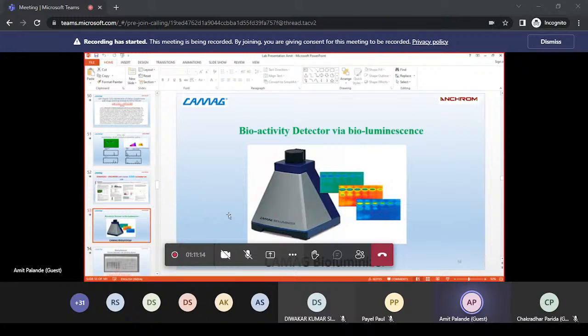The second example is the quantification of apixaban in apixaban tablets. We know apixaban as an anticoagulant or blood thinner tablet, which is used to prevent blood clots and to prevent stroke in people with non-valvular atrial fibrillation. It is detected in fluorescence mode, and then the graph is plotted. After plotting the graph, we found that 96.2 μg was present in 100 μg of the tablet.